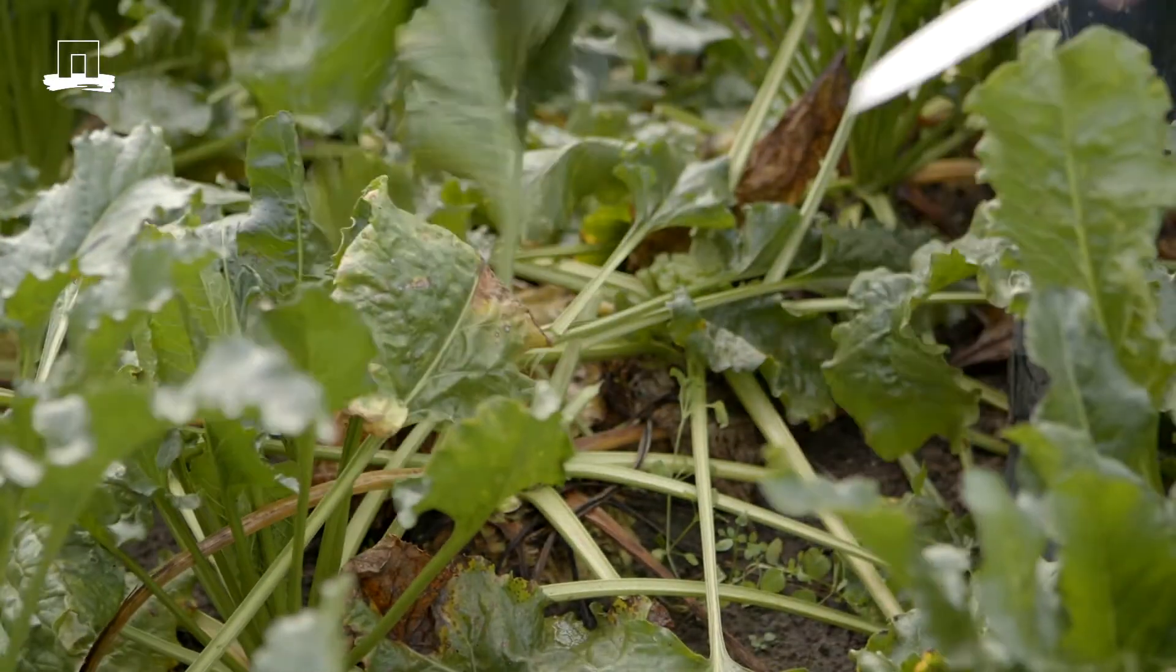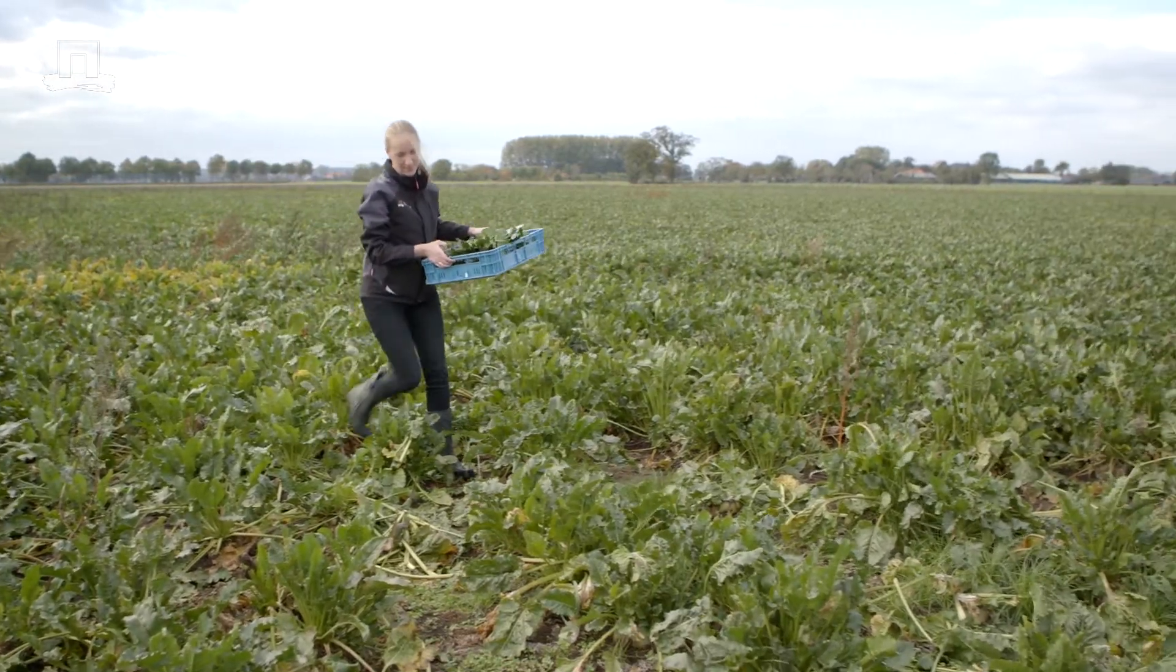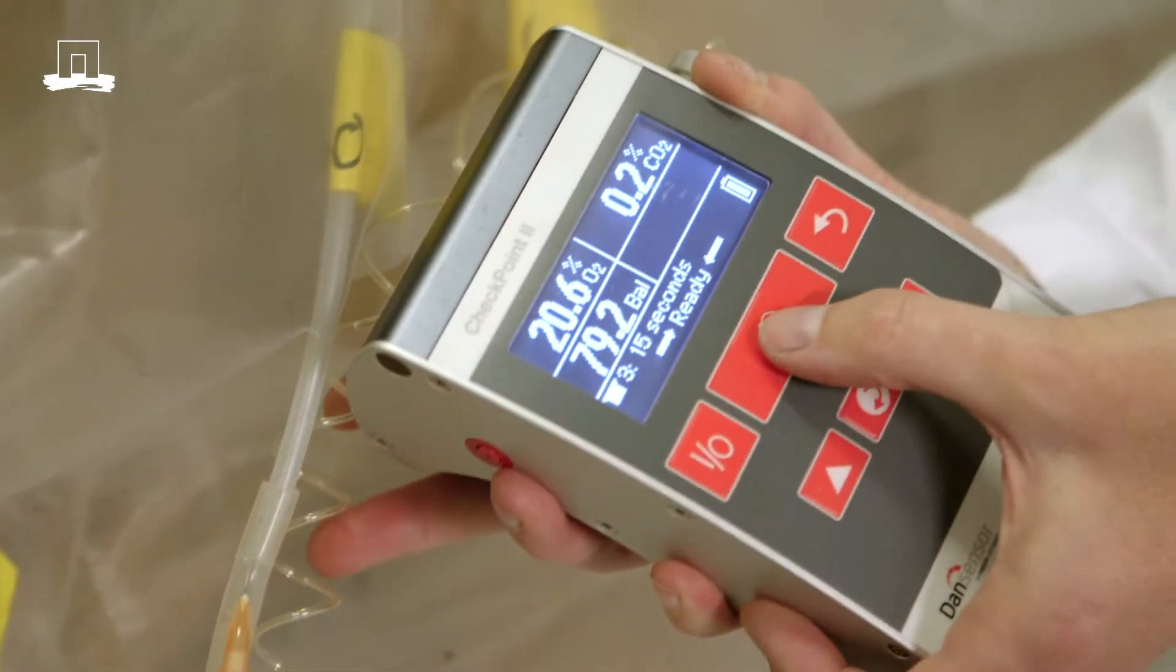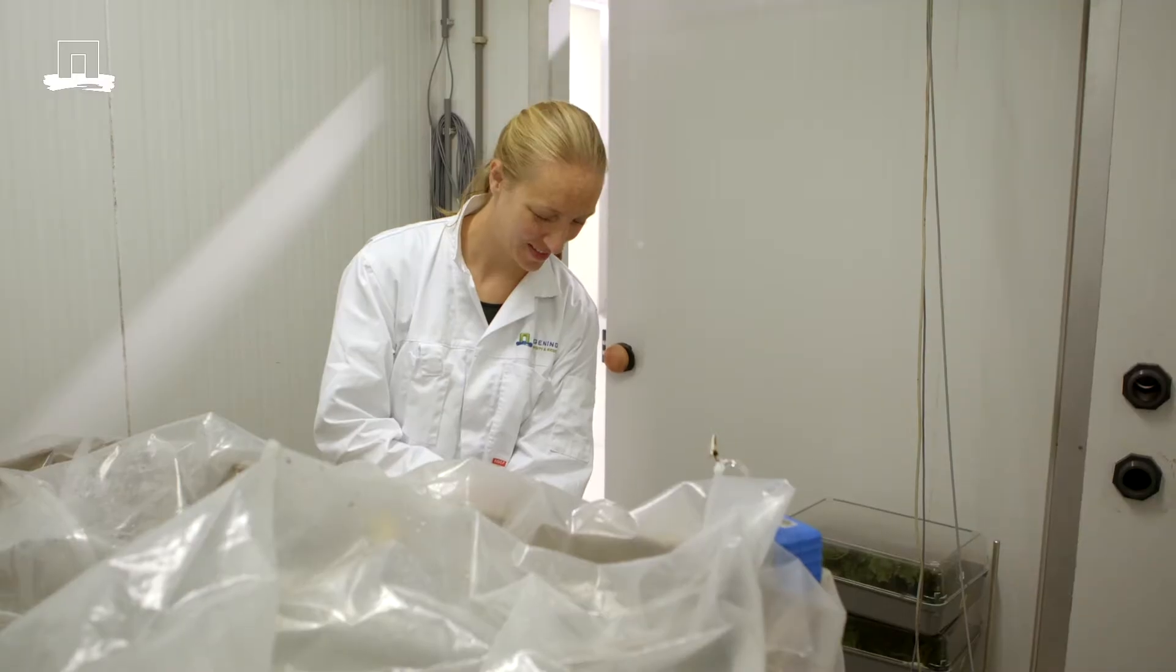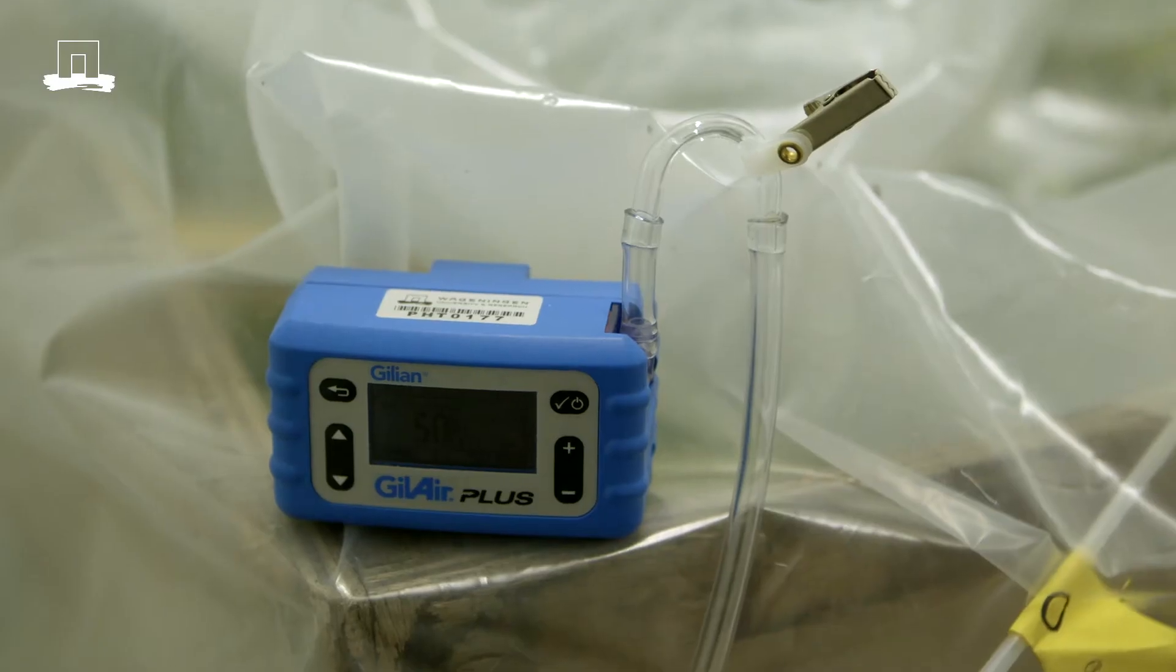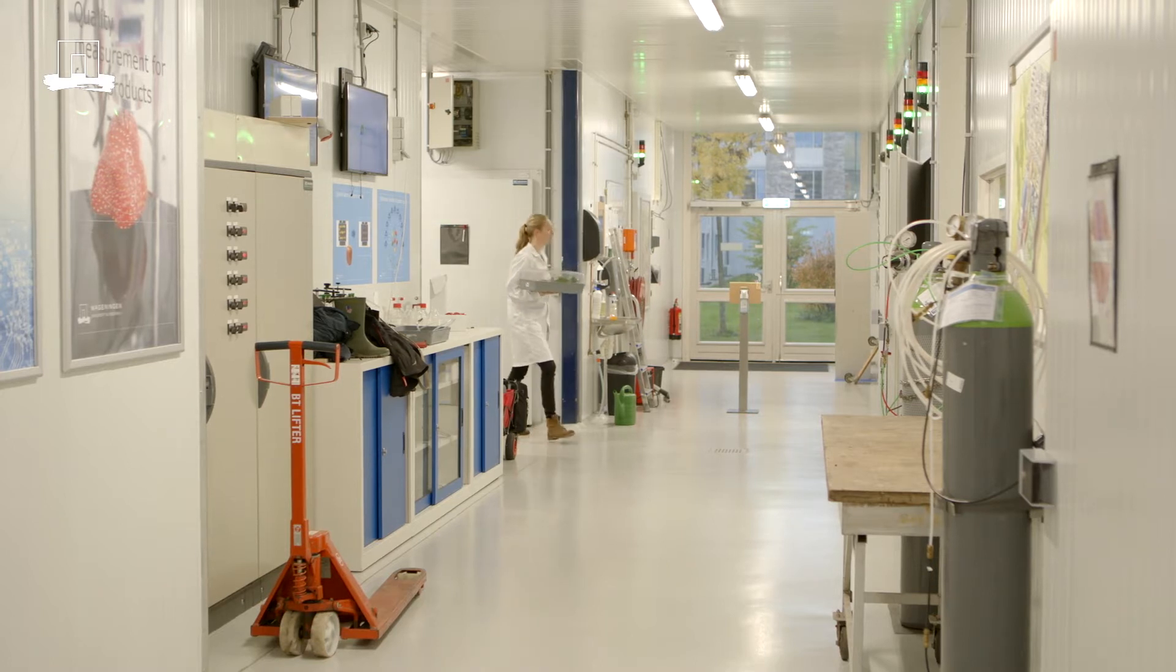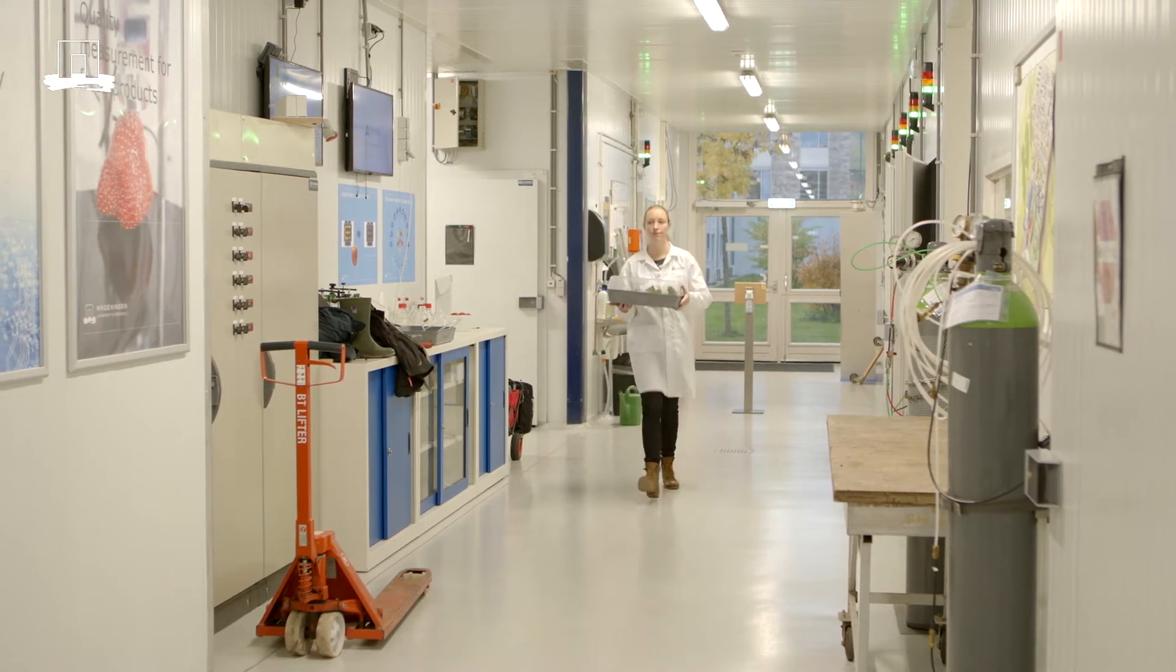For this experiment, we harvest leaves, followed by storage at different temperatures. Small boxes for precise measurements on laboratory scale are used, as well as bigger bins to mimic more realistic storage conditions. All conditions like temperature and air composition are well monitored.